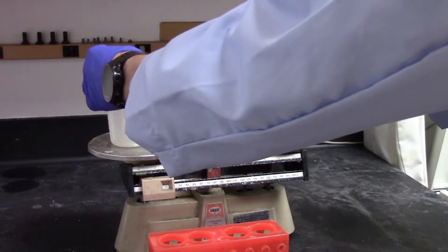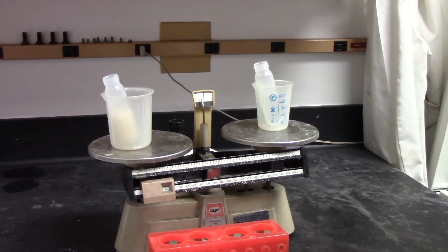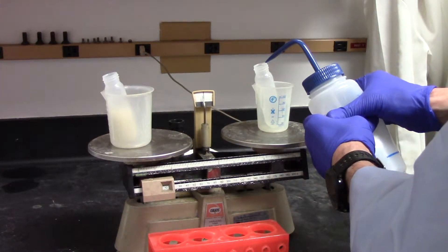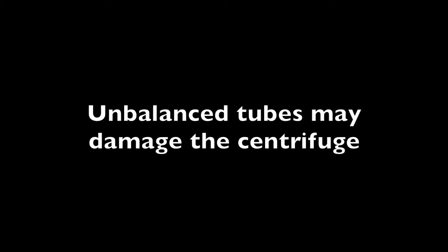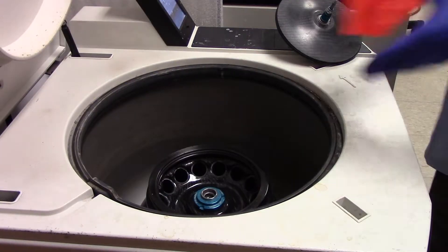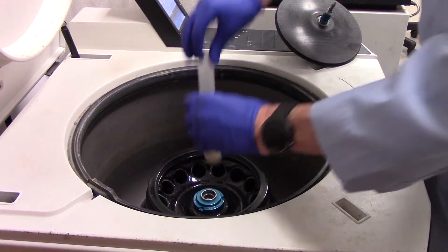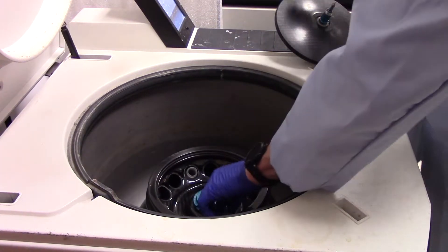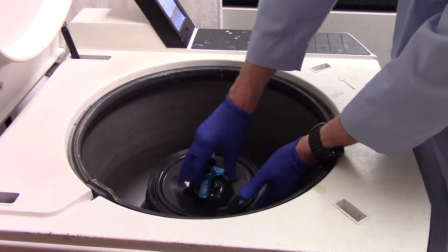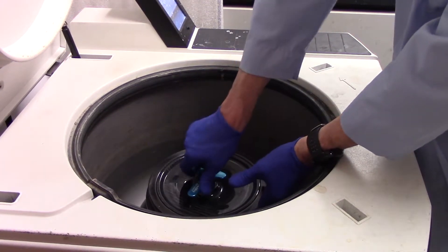Balance your tube with another high-speed centrifuge tube filled with water. Place your balanced tubes on opposite sides of the rotor in a centrifuge. Apply the lid to the rotor, making sure that it is tight but not too tight.